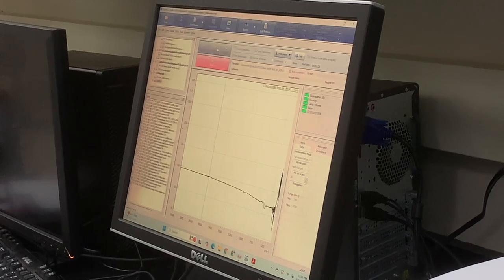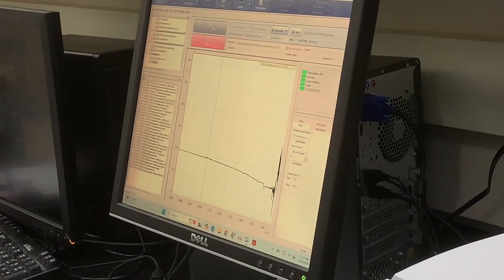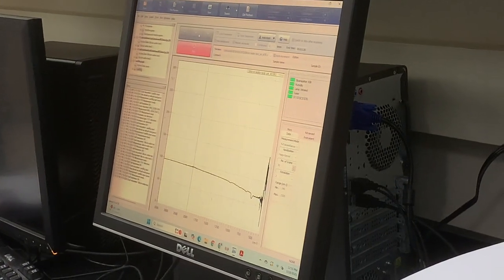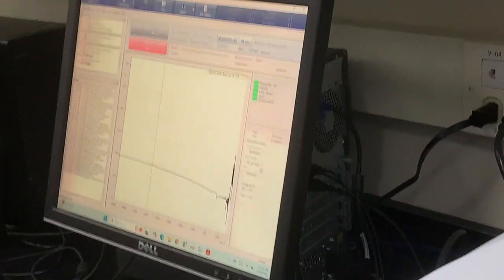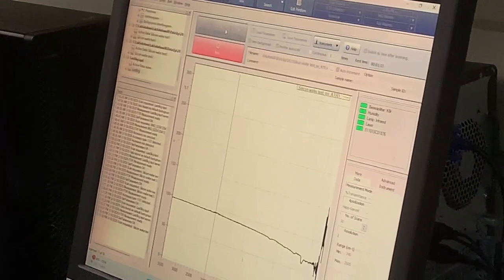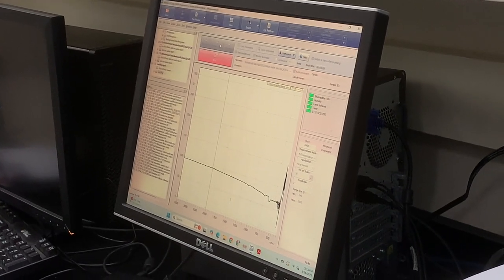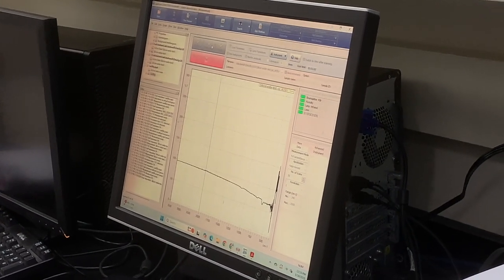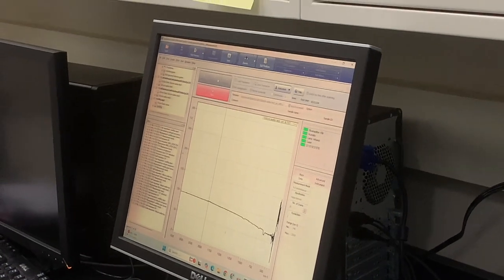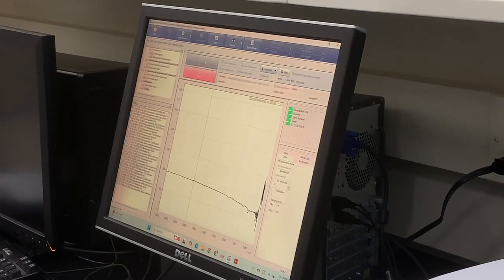And actually I've ordered the same silicon wafers recommended by these people. So I'm using the same type of silicon wafer. That's why I'm now kind of confused why it's opaque here. So I have to think about it again, because I was expecting that silicon wafer should be kind of transparent for specific wavelengths. It should be, yes, kind of opaque, not like this reference sample. But I was expecting to see some kind of pattern. Right, right.